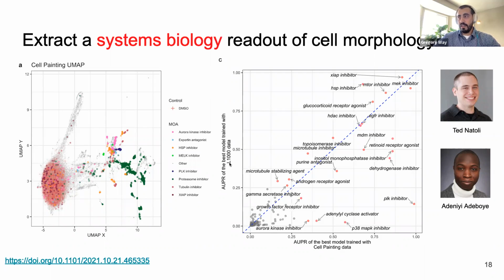And each of these axes represents how well our models were able to predict each of these mechanisms of action. So you can see most of the mechanisms of action we weren't able to predict at all. Either they had too few examples in the training set, or they just didn't have consistent enough signal in the data that we collected.